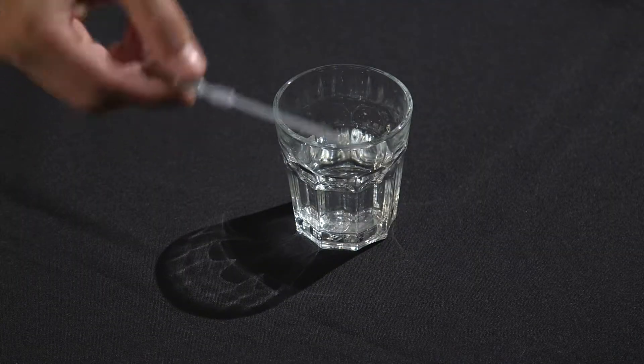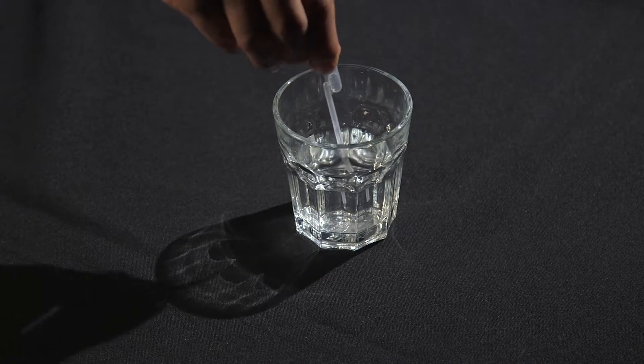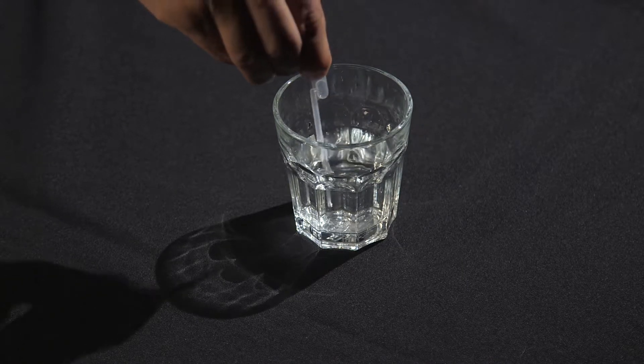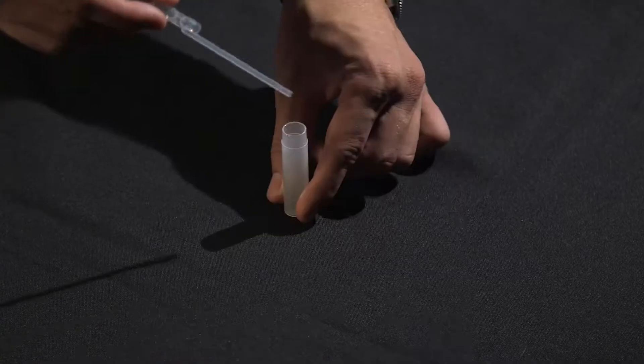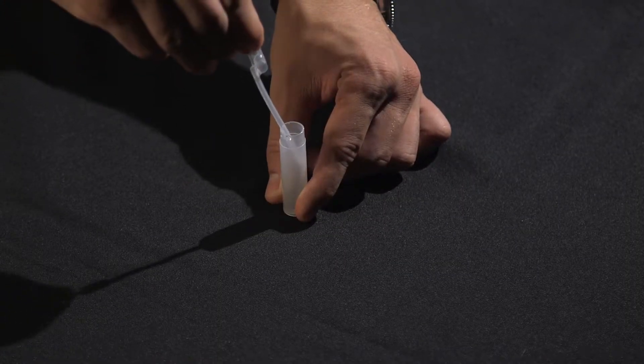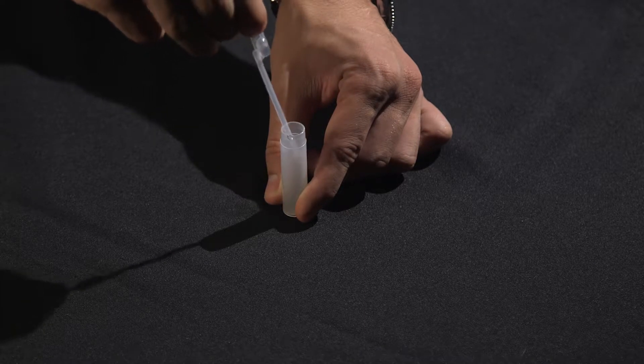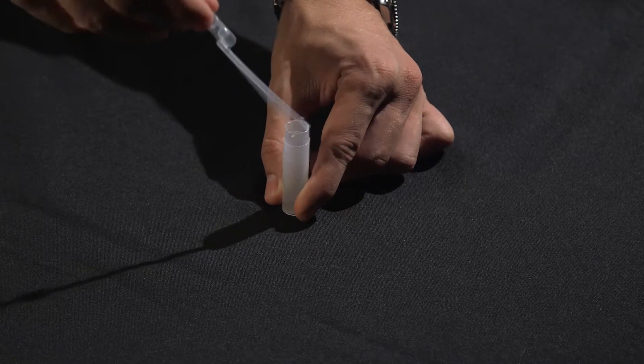Grab your dropper pipe by the top bulb and place the other end of the dropper in your water container. Squeeze the top bulb and then release it to suck the water sample into the lower part of the dropper. Then expel the water into your test vial by squeezing the bulb again. Do that process one more time to add more water into your vial.